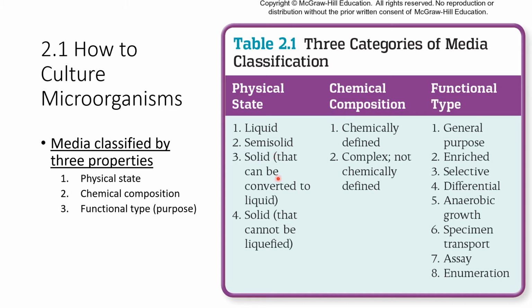If it's solid, is it supposed to remain that way? As the bacteria grow and increase in numbers, are they going to digest it away? Are they going to break it down? Yes, no. And then there's the chemical composition. Do we know everything that's in there, down to how many moles of salt, how many moles of certain nutrients? Or is it complex? It's a little bit of this, a little bit of that added together, and it's a rich soup. And then the functional type.